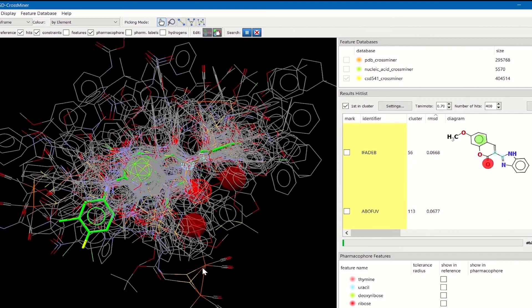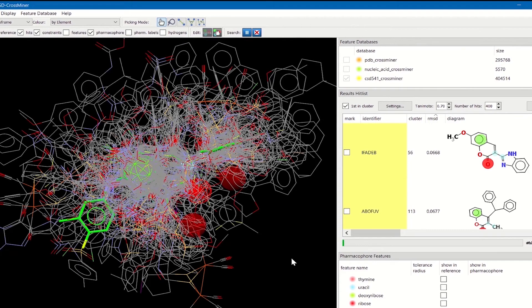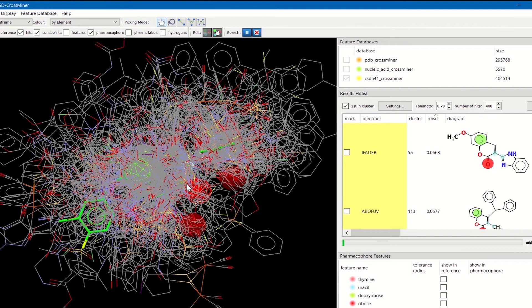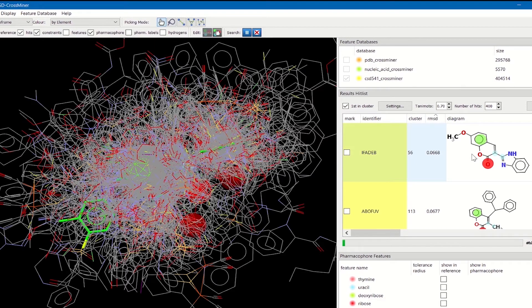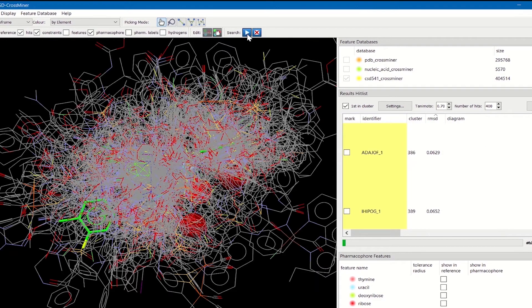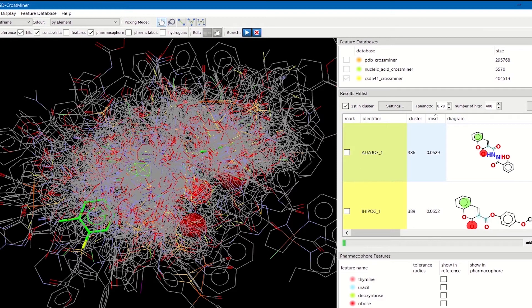The results matching the pharmacophore will immediately populate the 3D view and will also be listed in the results list. We can pause the search and take a look. The first thing you see is information about the identifier, and the color of the hit matches the database it is coming from.